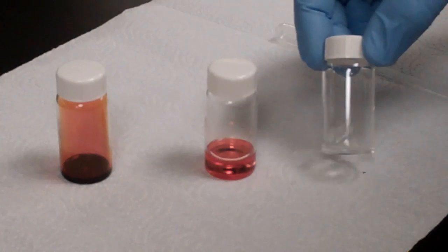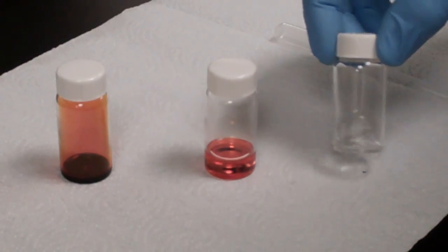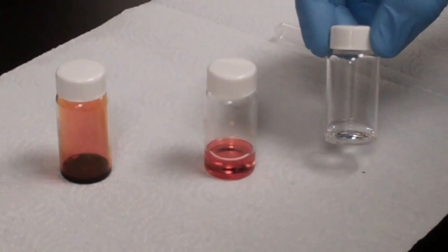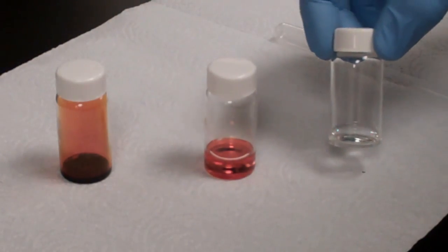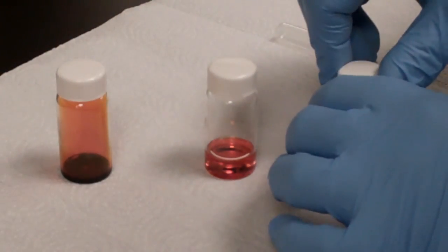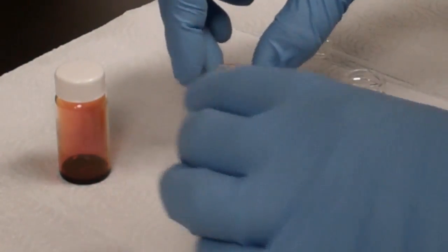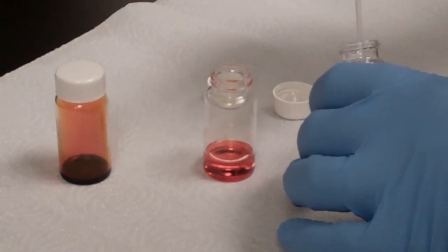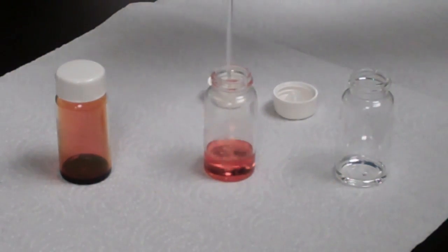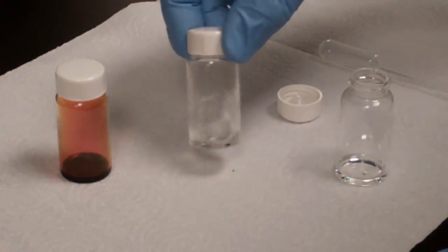And here, you probably can't see the liquid in there too easily. This is cyclohexene, which is just a pure alkene. You can also see that it's clear. And we're going to take a substantial amount of this and add to the diluted solution of bromine. We would never add this to the concentrated solution of bromine, given that the reaction is very exothermic and would probably overheat and boil away the solvent very energetically. So I'm going to carefully open up the cyclohexene and the diluted solution of bromine, and I'm going to take a little bit of the cyclohexene solution with my pipette, and I'll add a few squirts of that in there, and you can instantly see the disappearance of the color.